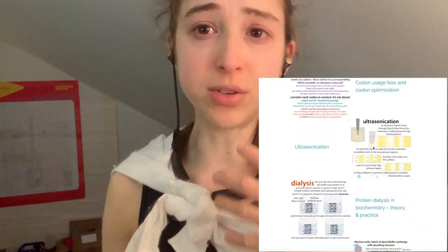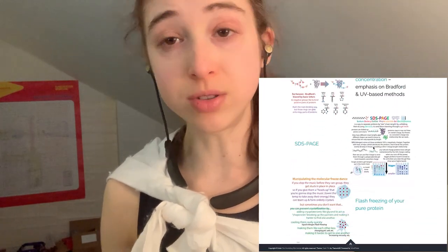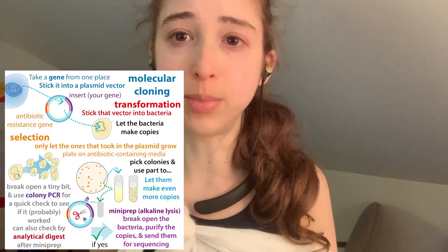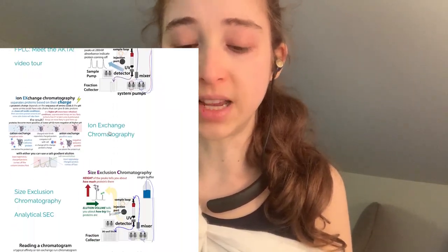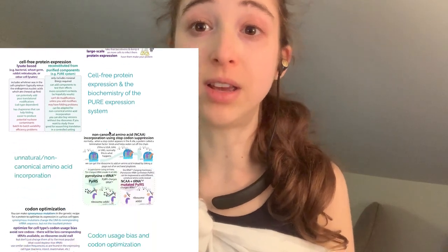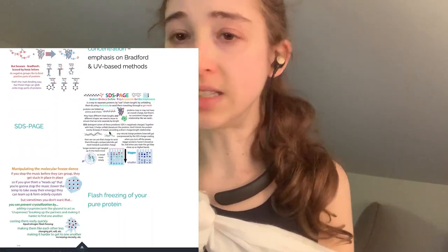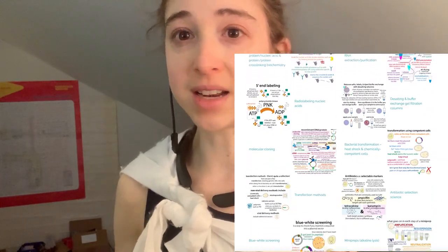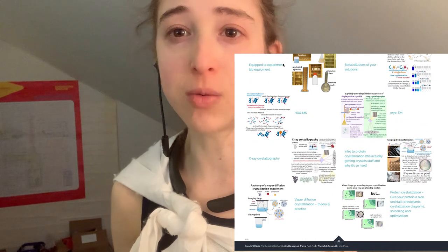So I want to direct you to those, as well as walk you through when you might want to use various techniques. We're talking everything from gels to cloning to protein expression, protein purification, all sorts of various techniques that can come in really, really handy. I am so grateful for all of these techniques that I have learned, and I'm excited to learn even more in my postdoc, which I start in just over a week.